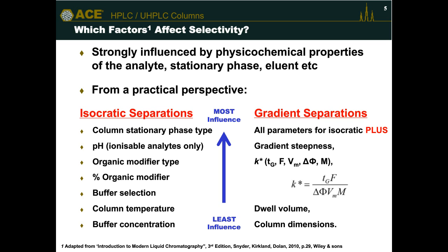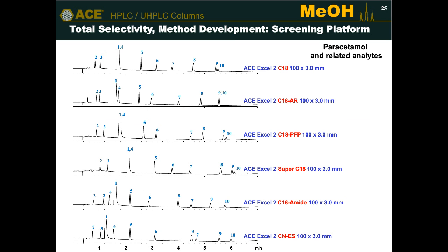Well, in the example I gave, the acetaminophen example, we were asked to develop this related substances method, and all of the compounds were available to us. So we just needed to develop the chromatography. So of course, for us, we could run the compounds individually. So we knew where they eluted, and we needed to develop the method so that we could have full separation of all the compounds. That's the easy situation.